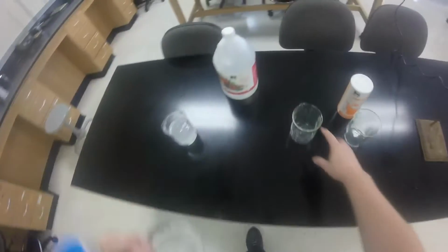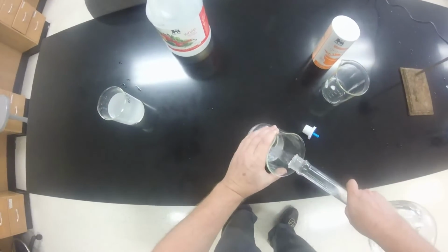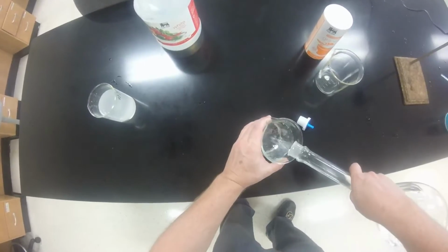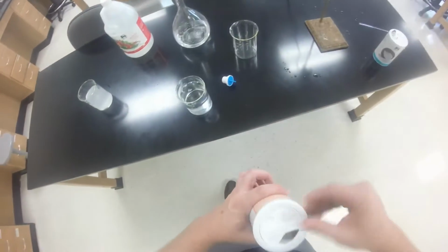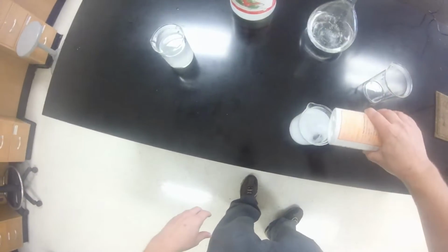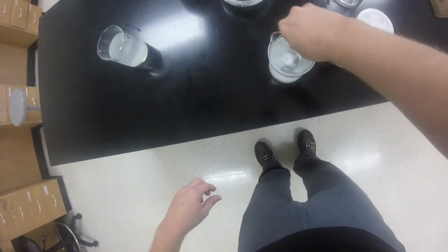So here we have our distilled water. Then let's try our sugar. Okay, so that's our glucose. It's a non-electrolyte, right? So now we have our sugar. All right. Now we need to rinse this off for just 1 second so we don't contaminate. Perfect. And then let's stir up our sugar in our beaker.